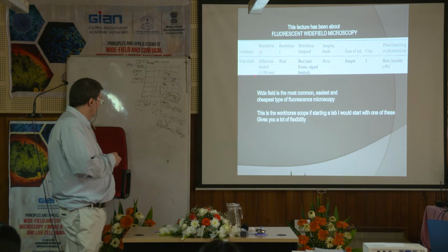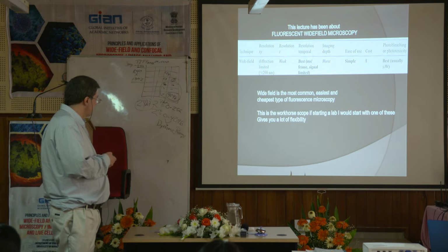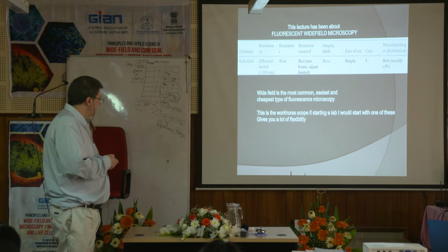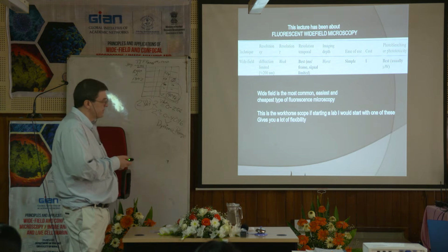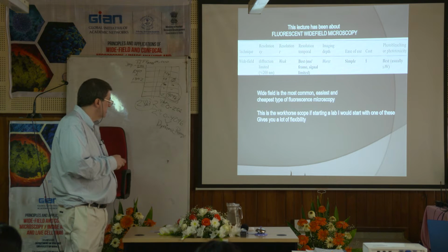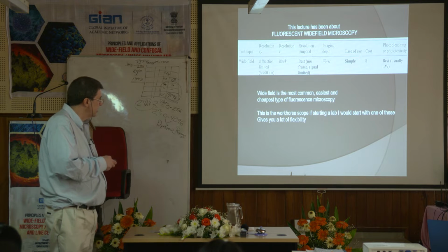It does a really nice job in X and Y. The Z resolution on it, fluorescence, is a little weak compared to a confocal. It can go very fast. If you have to go fast, the wide field's perfect. The images from the first day where he was going really fast were wide field images. It's pretty simple to use, and it's relatively cheap.